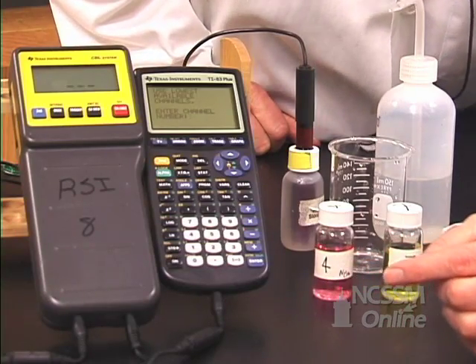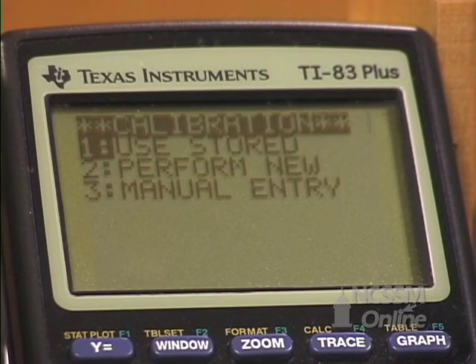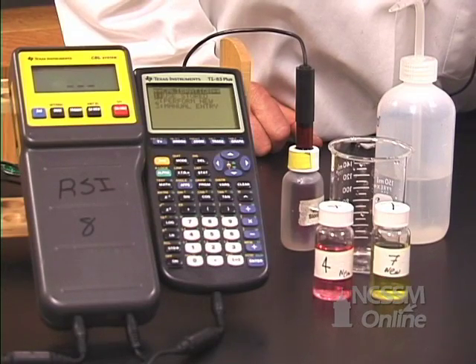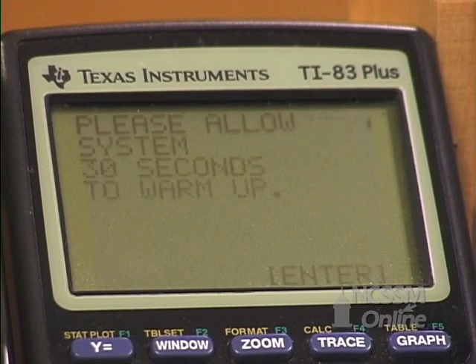It asks where you put the probe — remember we put it in channel 1, so press 1 and enter. Now we want to perform a new calibration. You should always perform a new calibration with a pH probe because they don't hold calibrations very well — it's a sensitive instrument. So let's perform a new calibration.